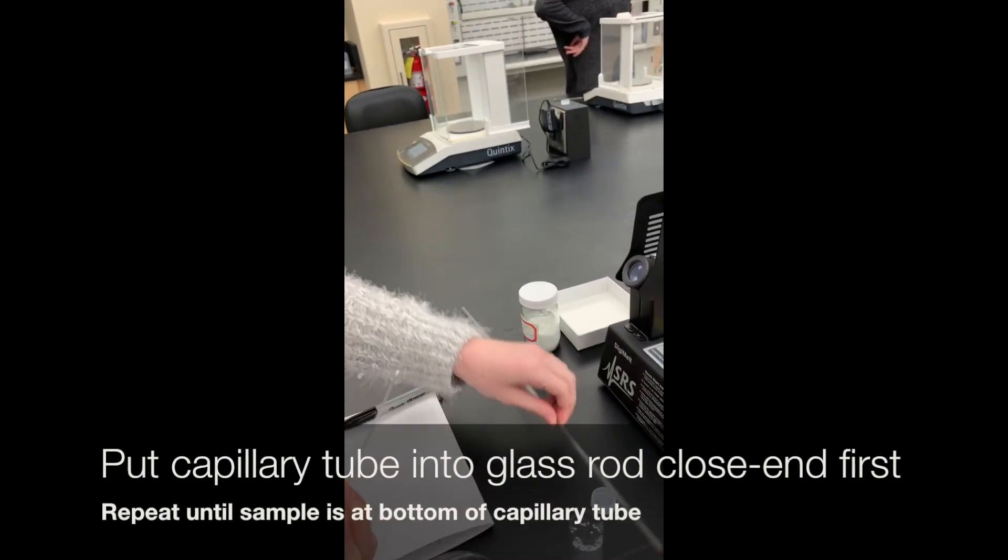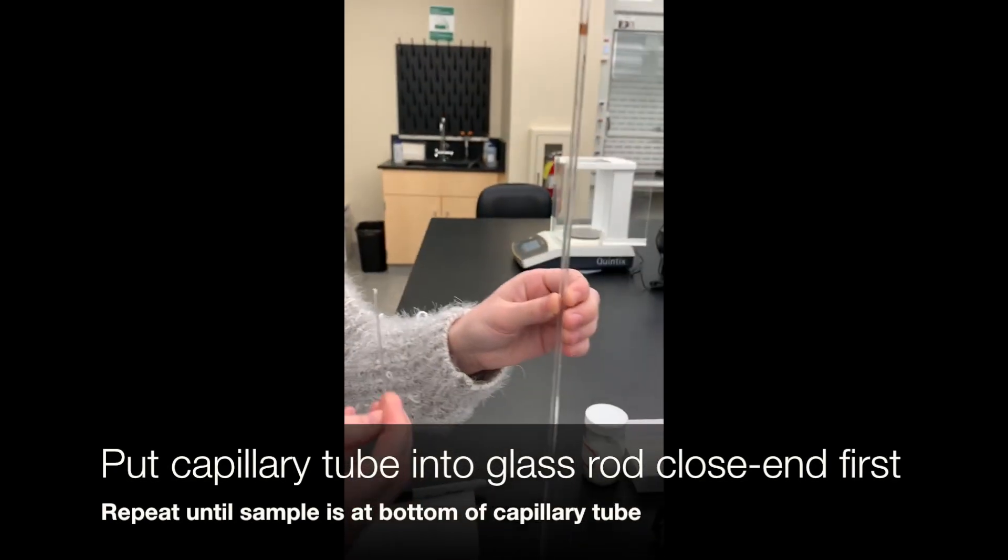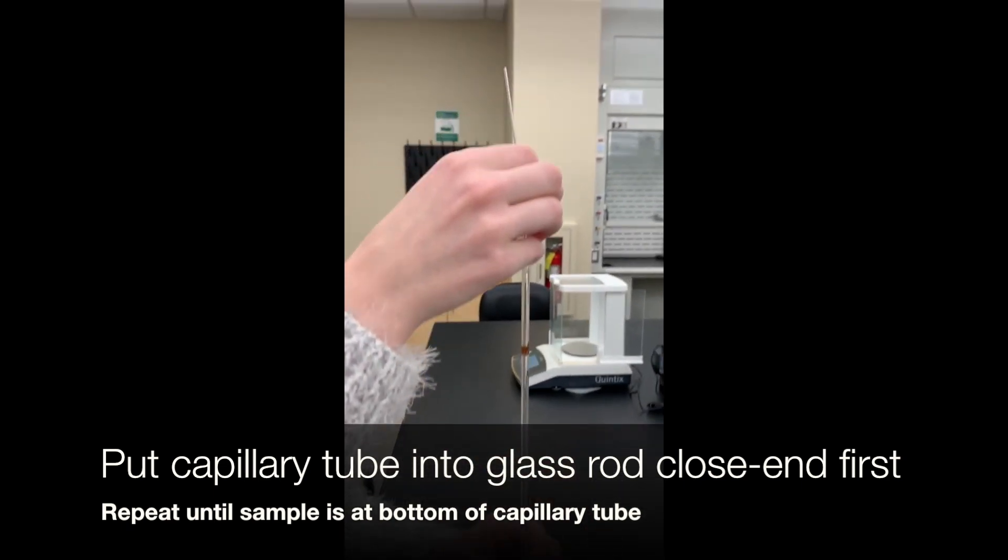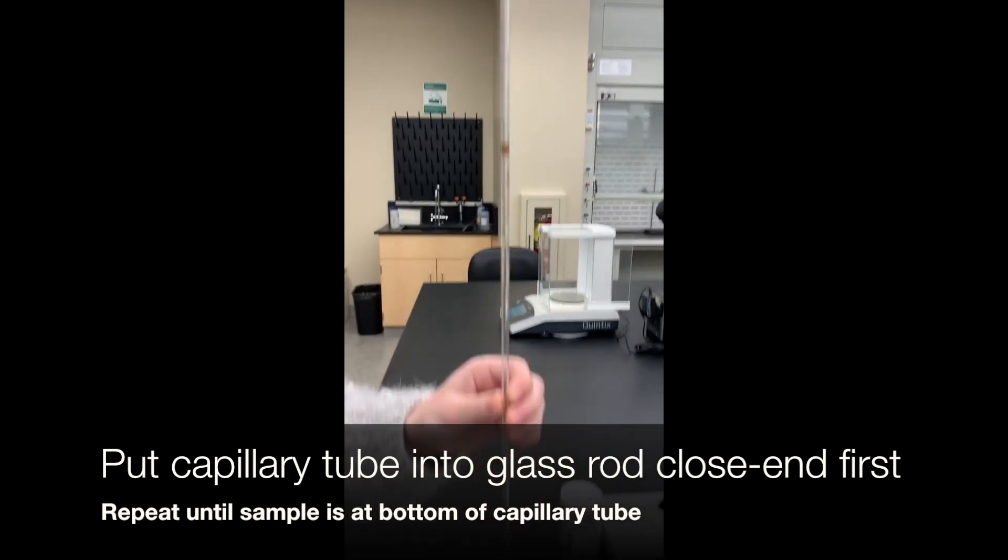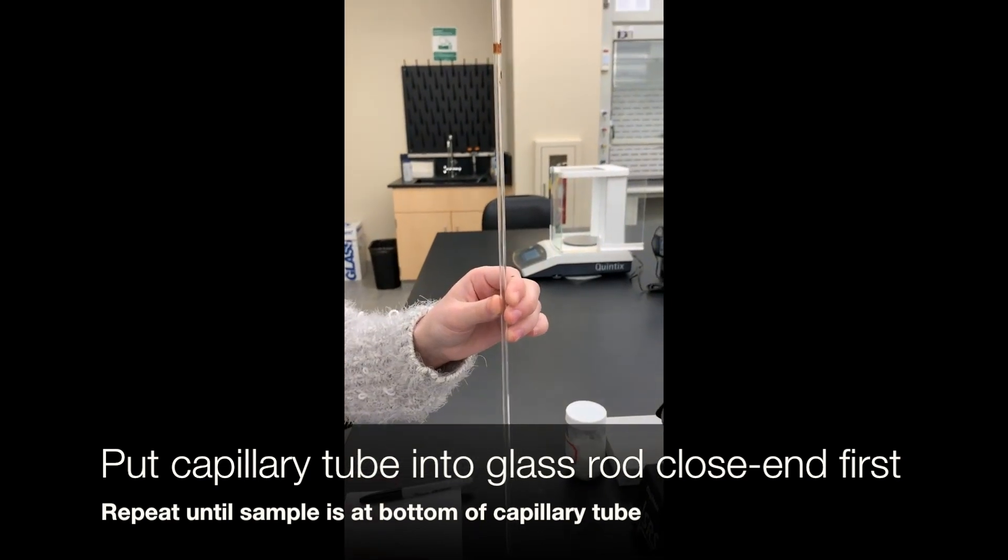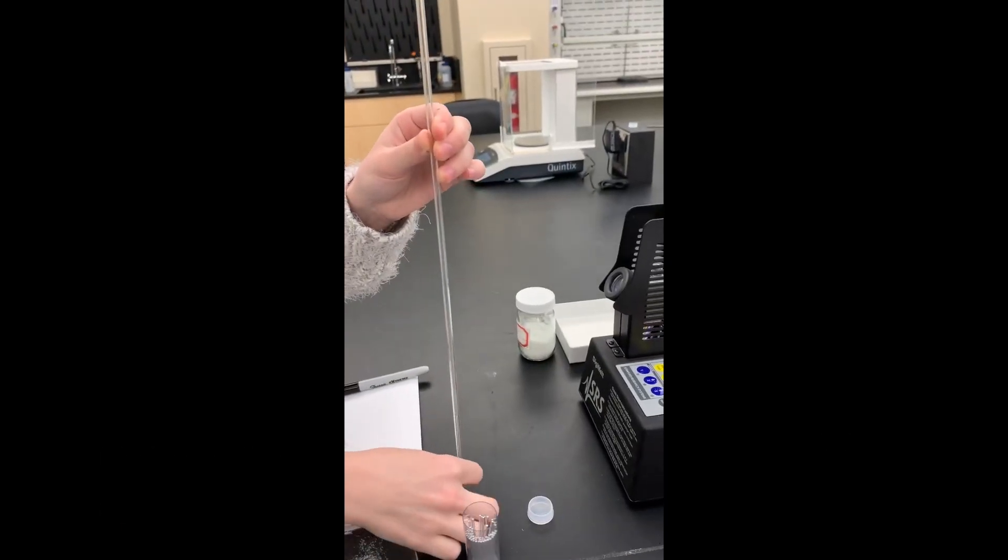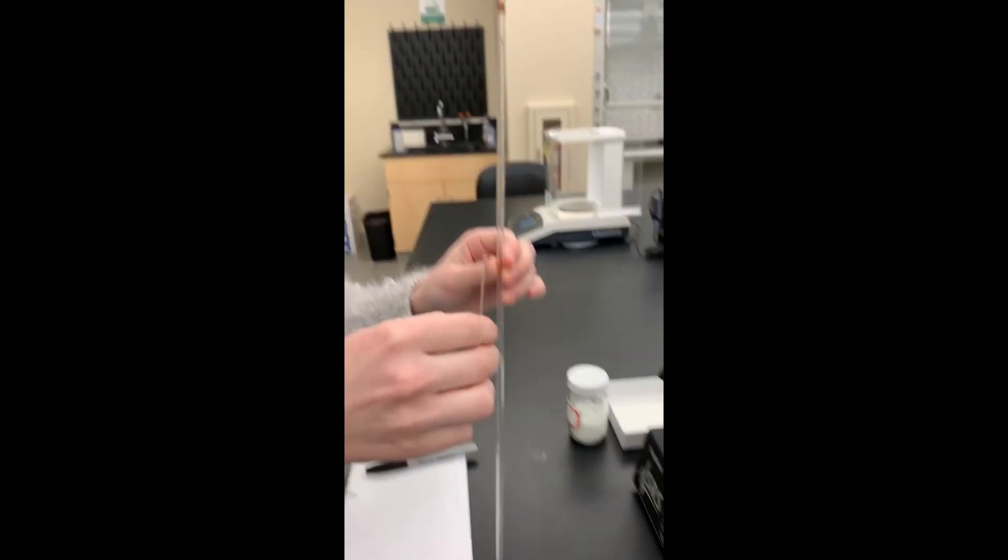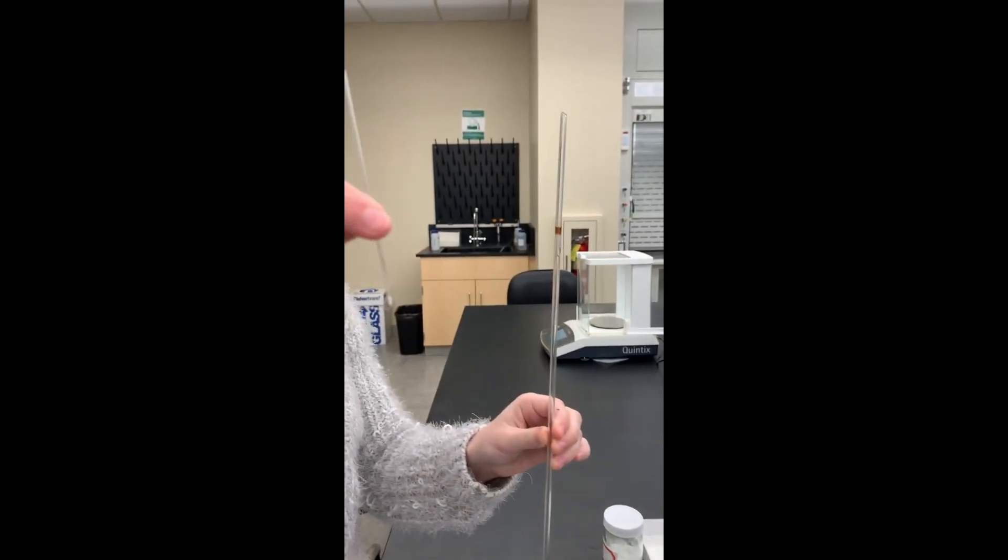Next, you need to push your sample into the closed end of the capillary tube. You will do this using a large glass rod. Place the rod securely on the bench top and drop your capillary tube closed end first into the rod. Repeat this process a few times until the sample is in the closed end of the capillary tube.